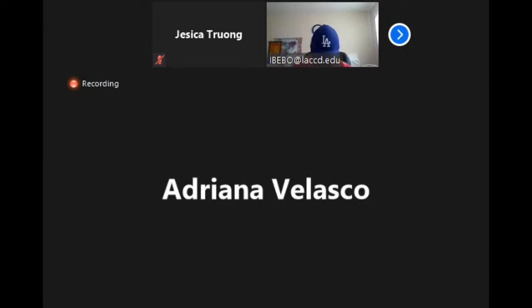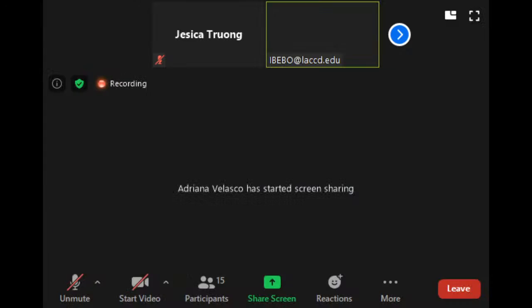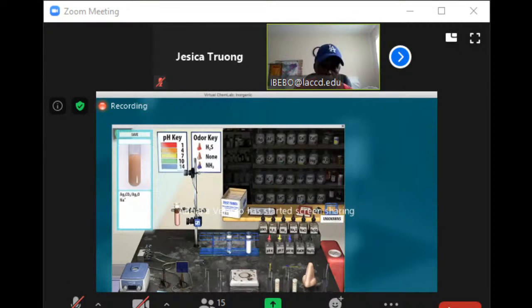Yeah, can I share my screen so I can show you where I'm at right now? Okay, yeah, I wanted to share screen. Okay, go ahead, yeah. Share. So this is what I have. So I got a light brown precipitate, yeah. And then that's the first part of 3, and it says write a correct balanced net ionic equation.